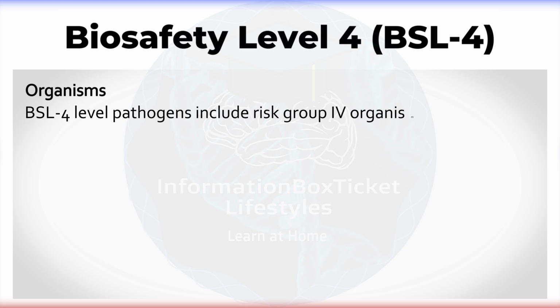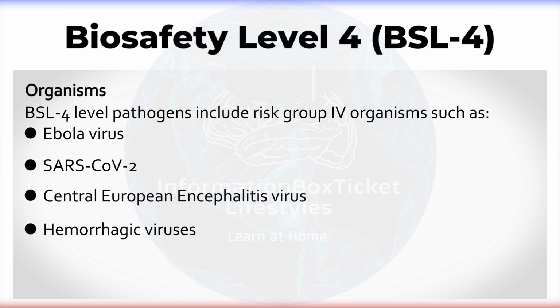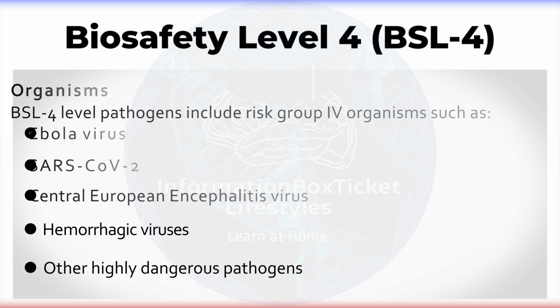Organisms. BSL-4 level pathogens include risk group 4 organisms, such as Ebola virus, SARS-CoV-2, Central European encephalitis virus, hemorrhagic viruses, and other highly dangerous pathogens.